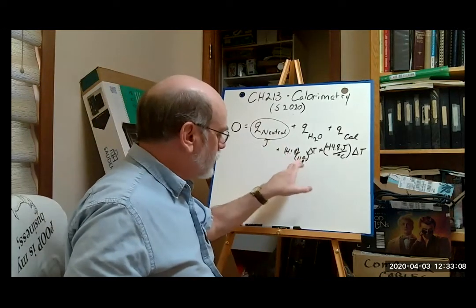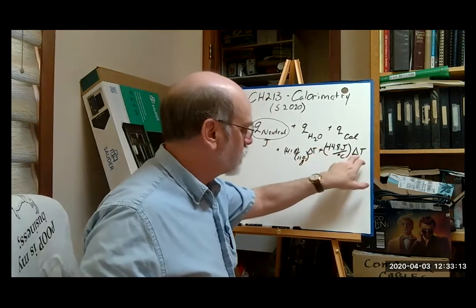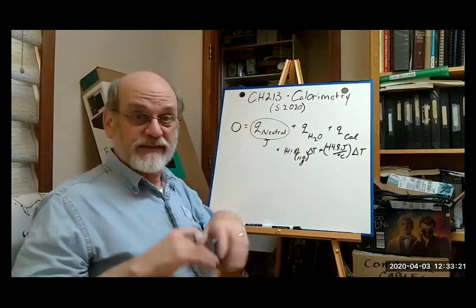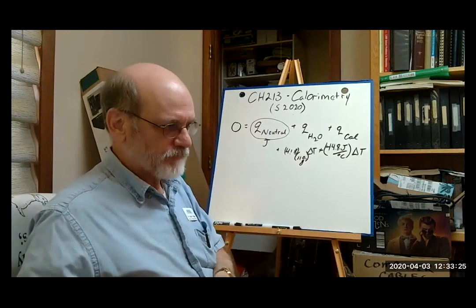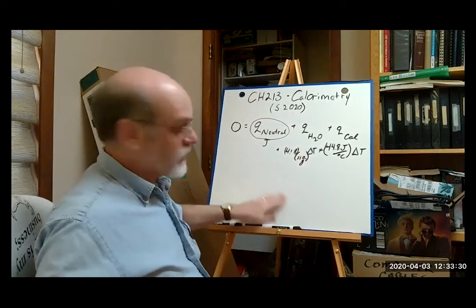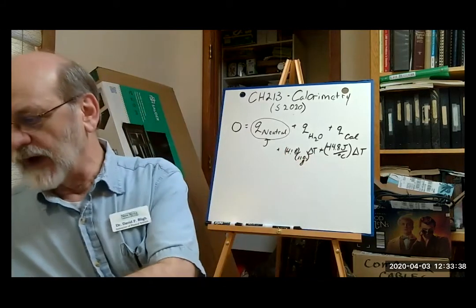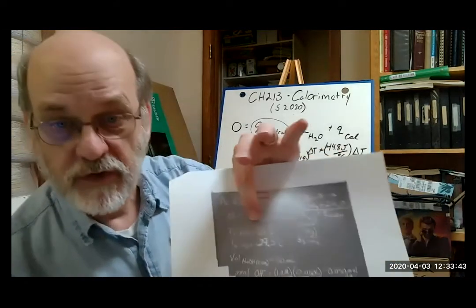So we know this, we know that. We're going to know this because we measured before and after. We know this, we're going to measure before and after here, and that's 0. We solve for that as our unknown. All right, so that's the term that goes into our heat of the reaction in subsequent calculations. So all we need to do is measure the temperature before and after. So what is it for water? Well, the initial temperature of the water was 21 degrees.